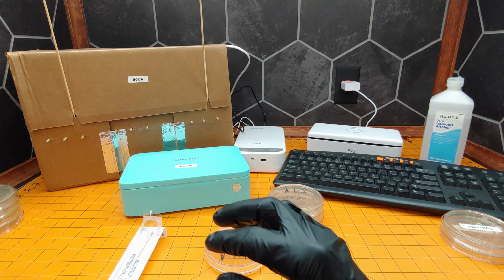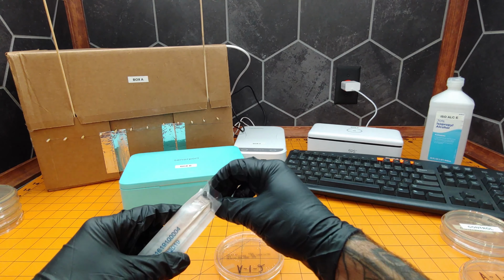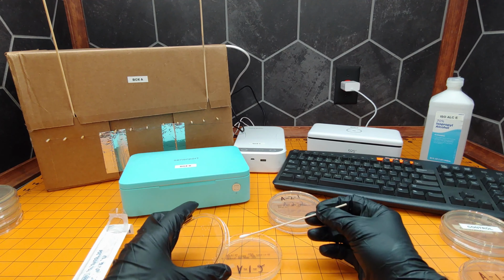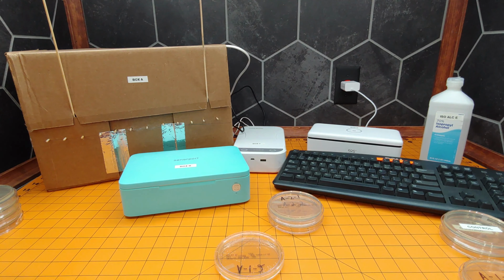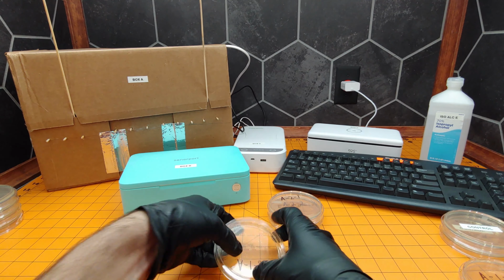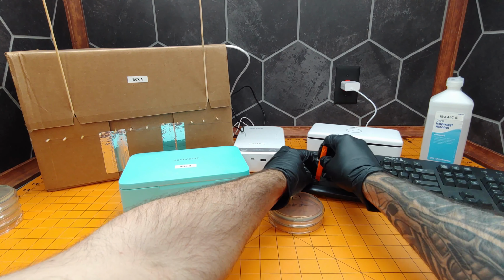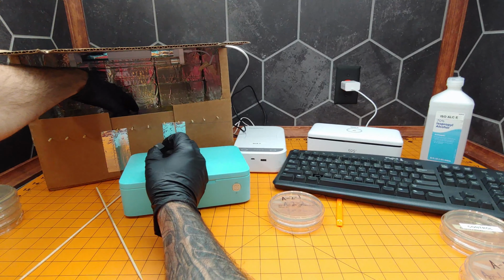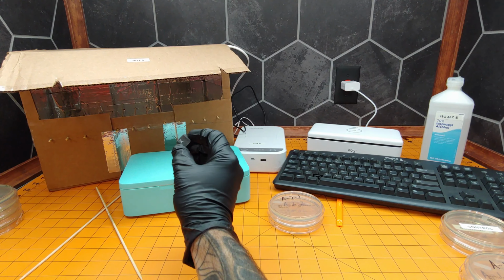We will put that aside and do our A12. We're going to repeat the same steps as before. Get a good swab of the X key, the same key we used before. And now that is trash. Next, we will simply remove the X key from the keyboard and pop it into our sterilizer box, which might be easier said than done with how small this key is. You'll have to give me just a moment.